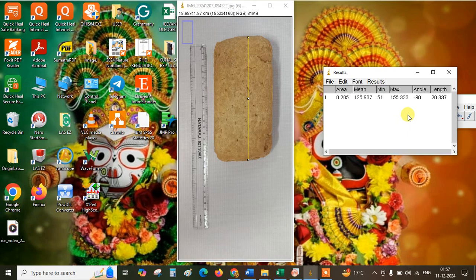Now if we want to take more measurements, we will look at the keyboard. We will press Control Shift, go to the edge, and using left click we will again drag a line. Then we'll go for Control M. So we can either do Analyze and Measure, or we can use Control M for measure.